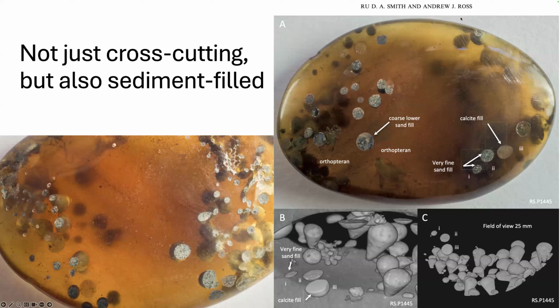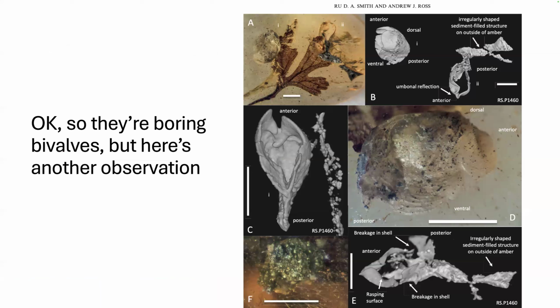And yeah, it's clear by now. De Grimaldi knew this as well. So they actually are boring bivalves, piddocks, if you like. But then there was another observation, and it's this.